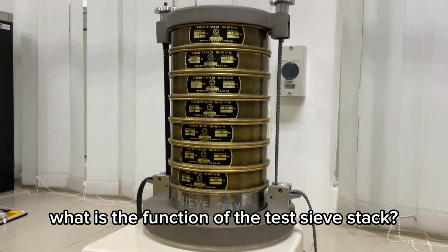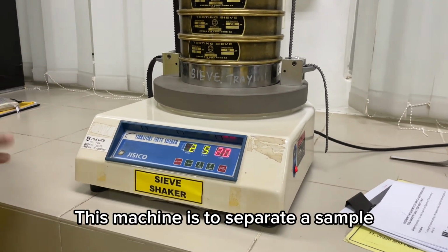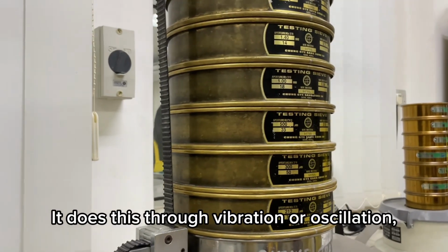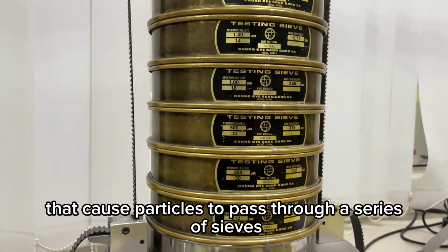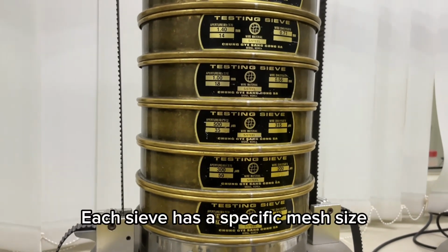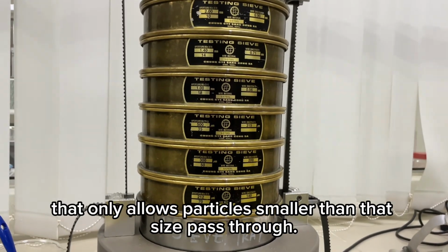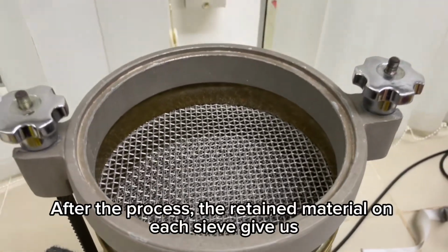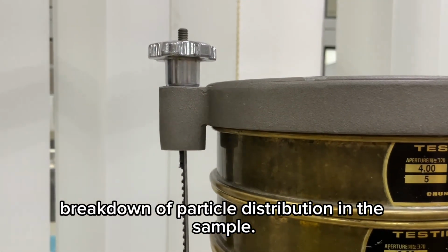Now, what is the function of the test sieve stack? This machine is to separate a sample into different particle size fractions. It does this through vibration or oscillation that cause particles to pass through a series of sieves. Each sieve has a specific mesh size that only allows particles smaller than that size to pass through. After the process, the retained material of each sieve gives us a breakdown of particle distribution in the sample.